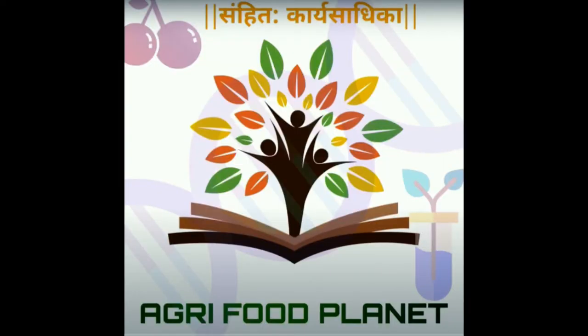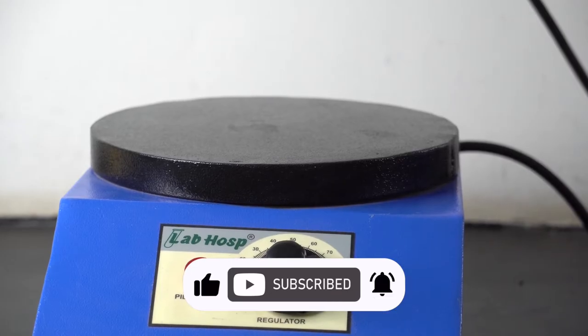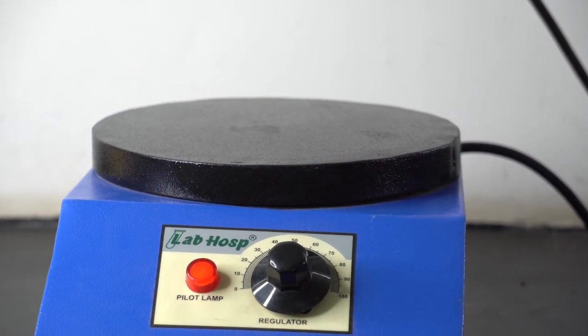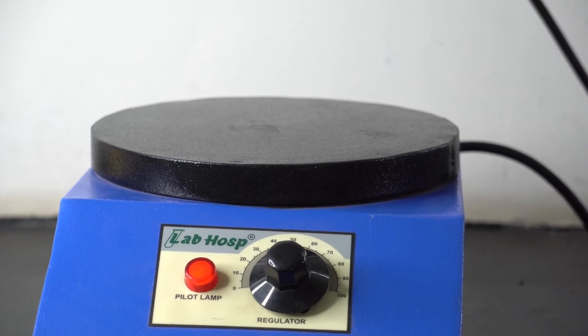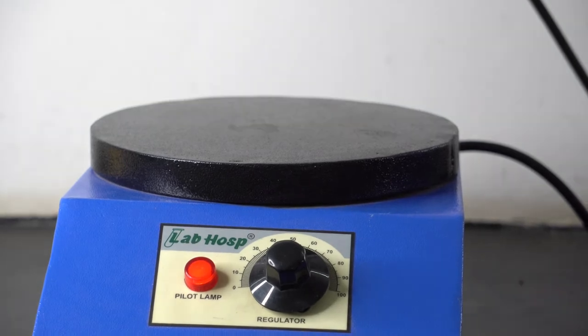Hello everyone, welcome to Agri-Food Planet. Today we are looking into how to operate a hot plate in the laboratory. Before we start the operation of the hot plate, here is a little information about what is a hot plate and its working principle.